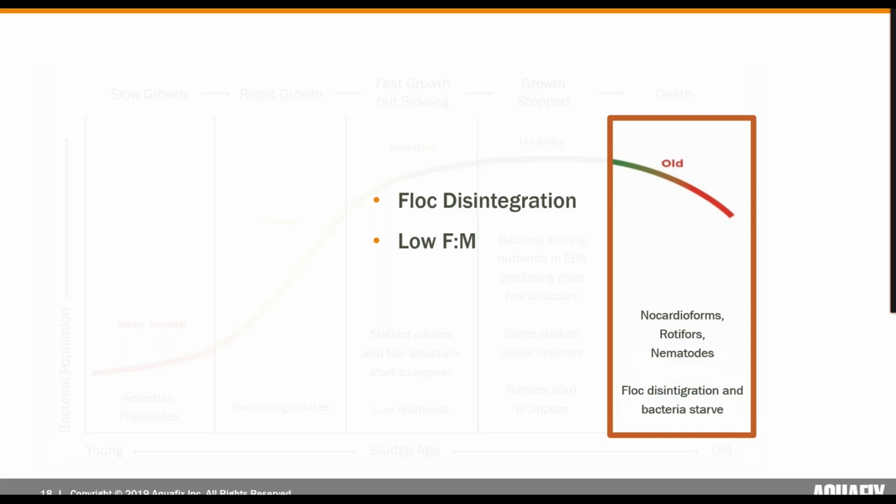And so it's important to remember that there are many variables, including influent nutrient levels, amount of wasting, and sludge age, that all are going to determine the F to M values. And what we're looking at here and what we're explaining are just general trends that we commonly see and observe within wastewater samples and specific wastewater plants that we've been working with.